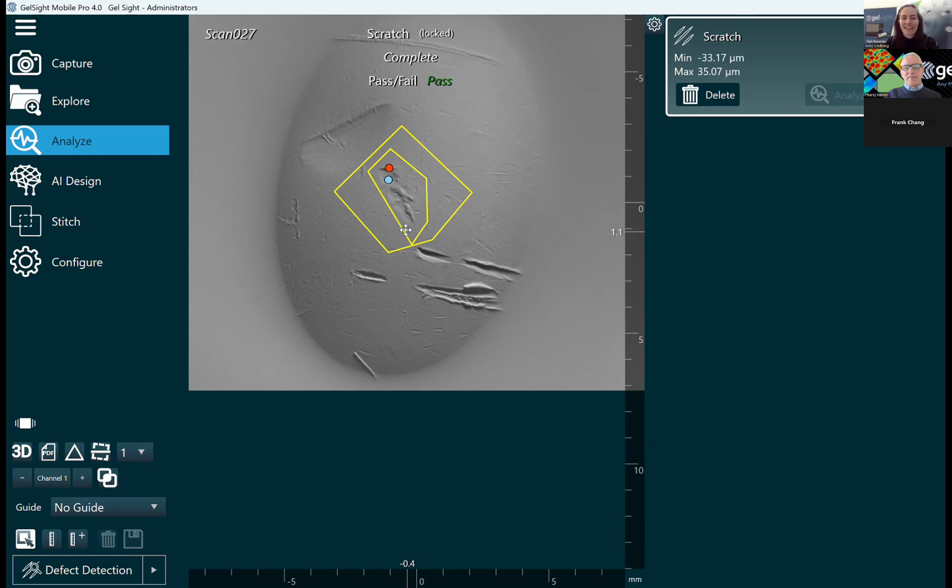All right. And we've got, what is the maximum length that stitching can be used for? So for this one, it depends. It depends on the computer processing specs that you have. So I think, Thierry, maybe you've gotten the most scans in one stitch out of all of us, right?